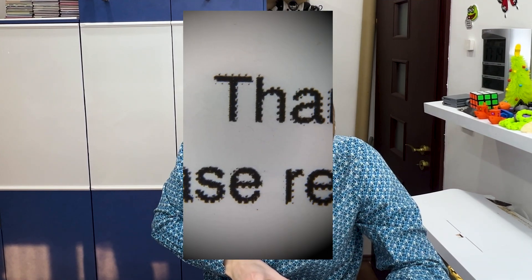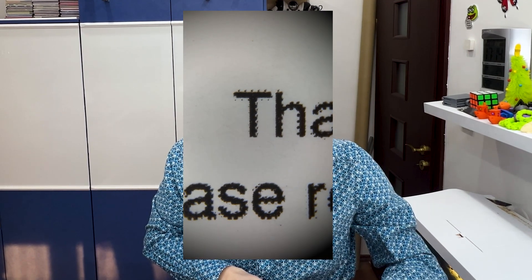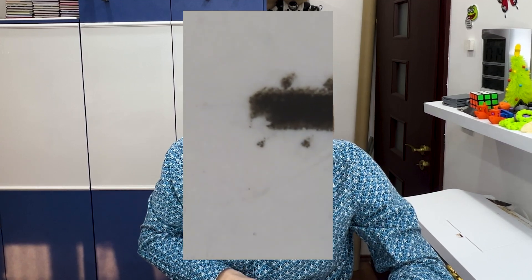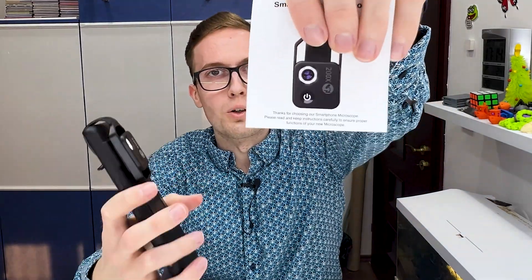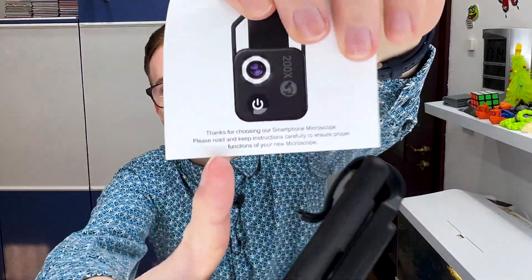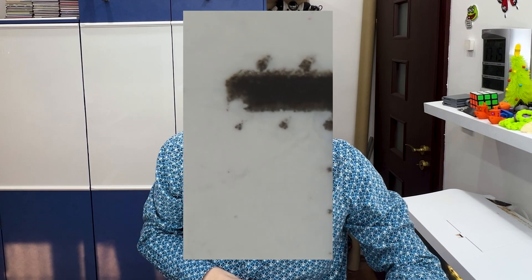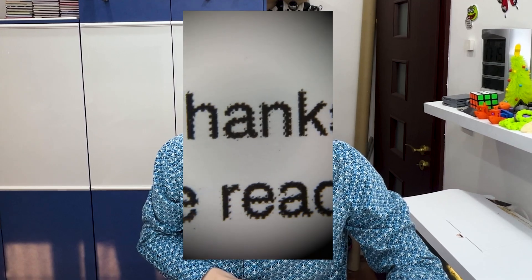This is the main lens at one times zoom on the smartphone. Let's use the digital zoom of the main camera. This is the seven times zoom on the main camera and this is the quality and level of zoom that we can achieve using this. I'll show you once so you know what I'm zooming — this is the text on the bottom right here. This small text — and that's this text under the microscope using seven times digital zoom, and this is using one times digital zoom with the main lens.